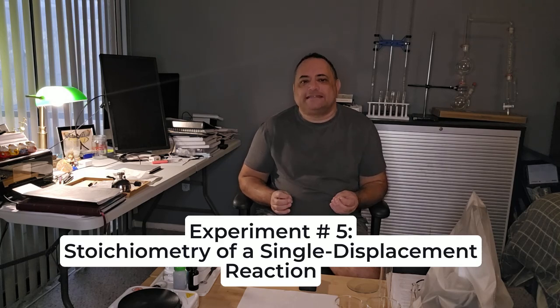Hello, in today's video, we're going to be looking at the stoichiometry of a single displacement reaction. Wow, that's a bit of a mouthful. Let's break it down. Stoichiometry, what does that mean? In a chemical reaction, matter can neither be created nor destroyed according to the law of conservation of mass. So the products that come out of a reaction must equal the reactants that go into the reaction.